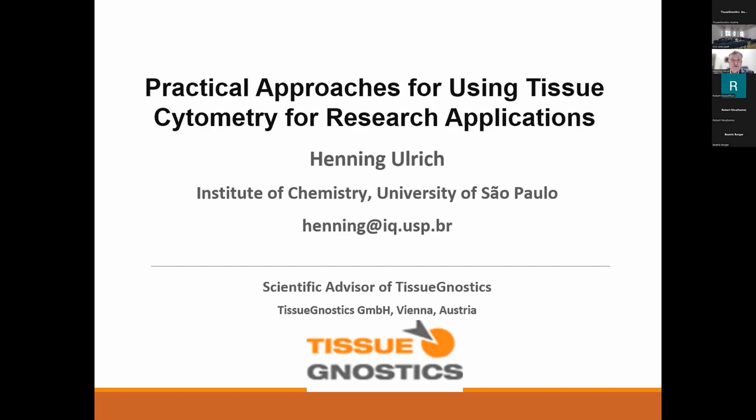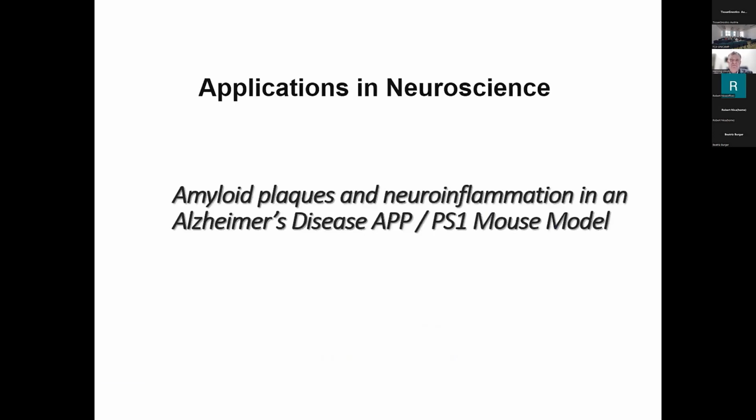So I will first go with you a little bit through what can be done using the TissueFAXS. I have the TissueFAXS confocal, which in principle also permits three-dimensional imaging. And what I will show you overall is some data on how we investigate Alzheimer's disease mechanisms in a mouse model.